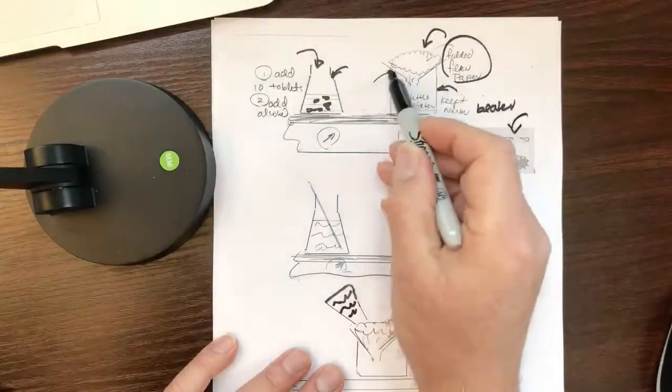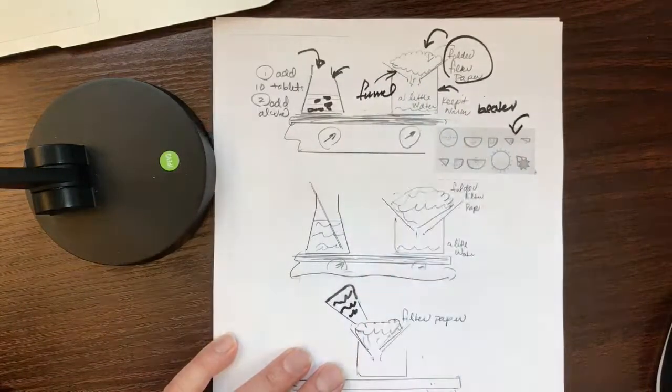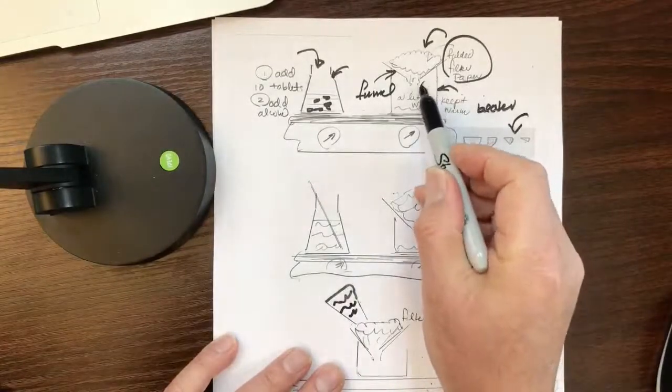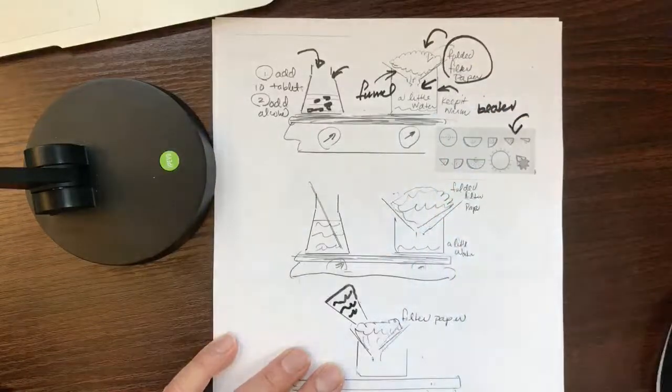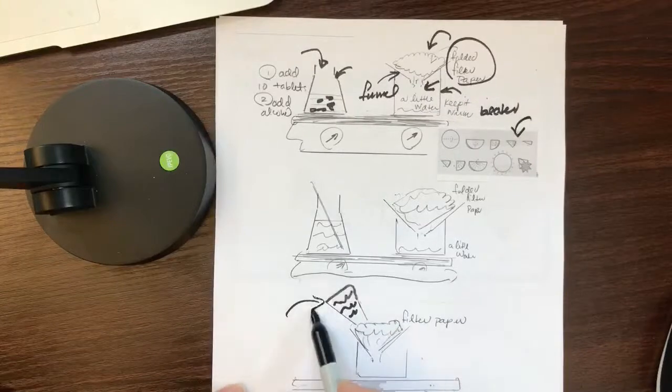Then you use a funnel here. This funnel has a broken stem. See this here? The key is to use a funnel with the broken stem. Put the filter paper inside. Once everything dissolves and is heated, and everything's good, we're going to filter.